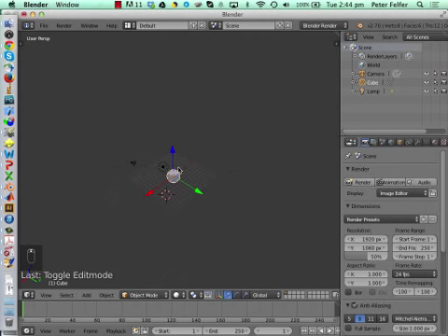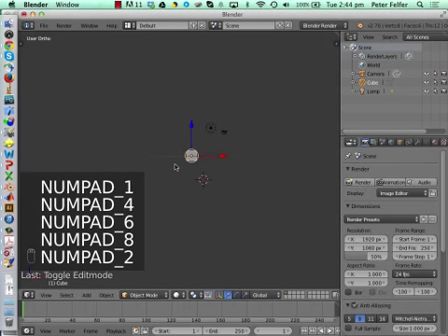One of the important things when you're working with Blender is you really need a keyboard and you really need a mouse. Don't do it just on your laptop. It's going to be a massive pain. I do it occasionally if I'm on the go, but I avoid it whenever I can. One of the main reasons is because you've got the number pad.